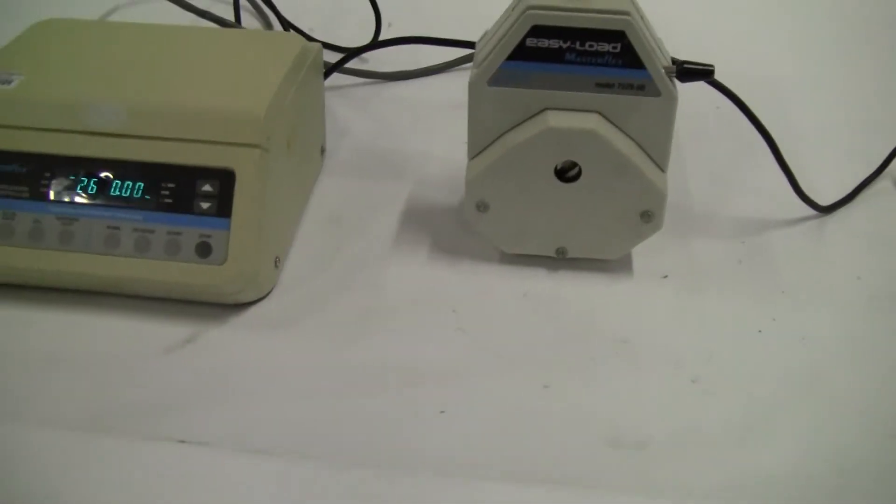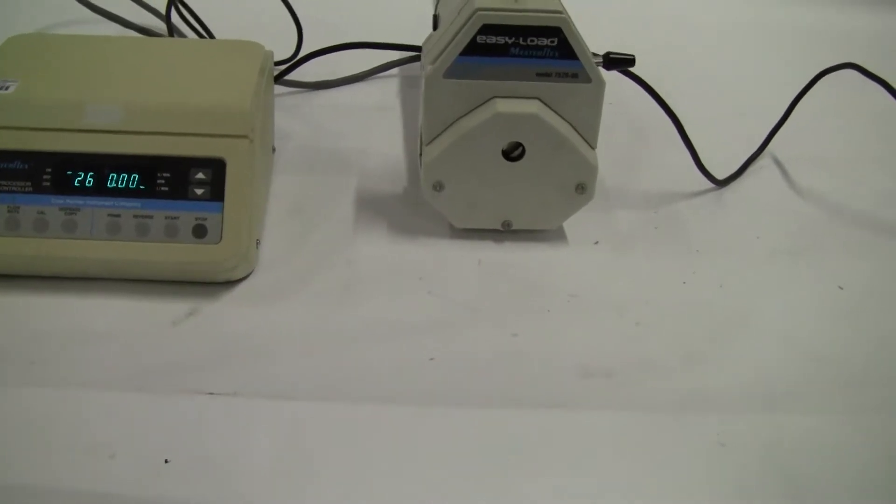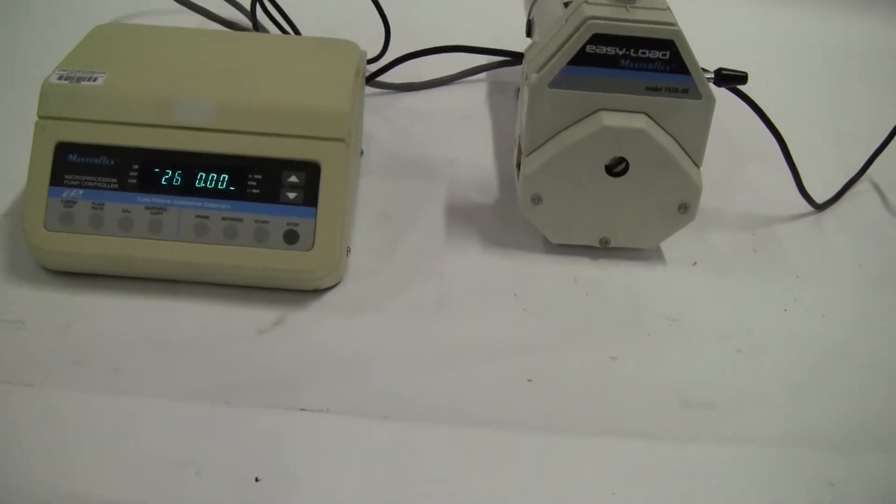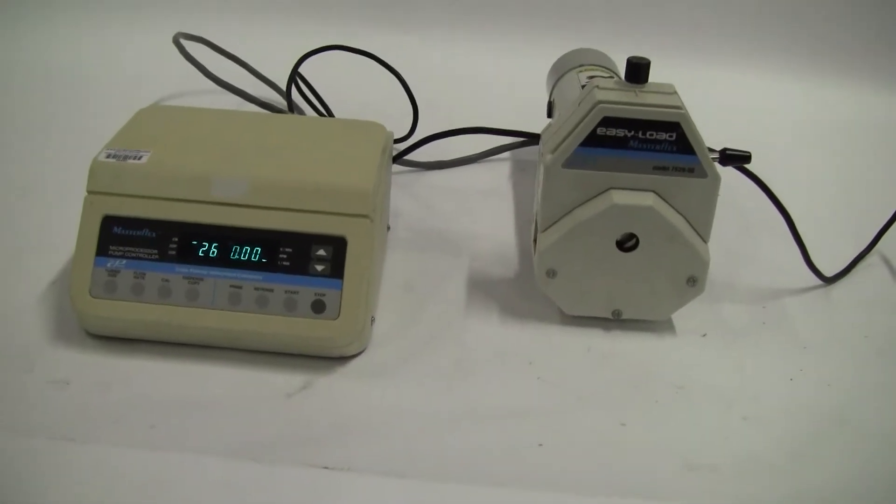You can see it has an RPM range of 20 to 650. The minimum flow rate is 0.01 liters per minute. Maximum flow rate is 13.0 liters per minute with a maximum pressure of 40 psi.